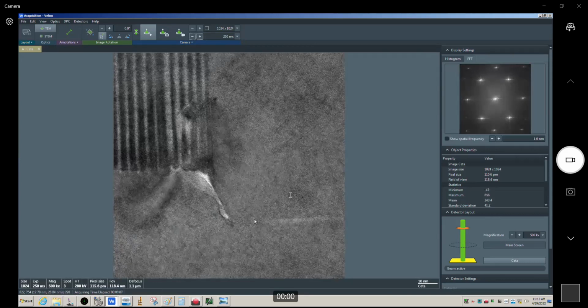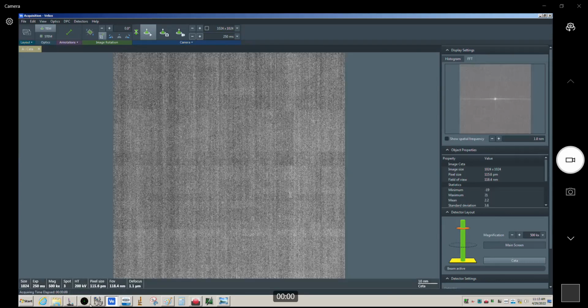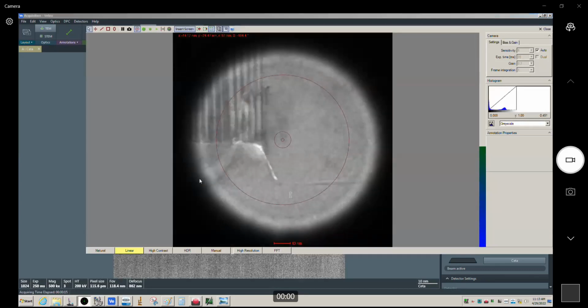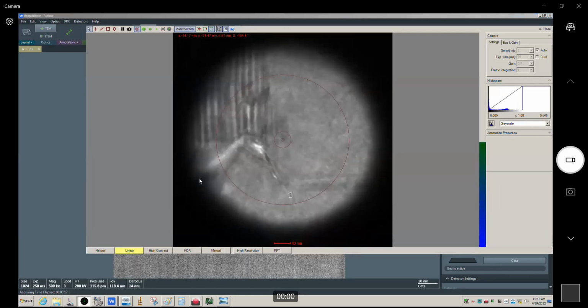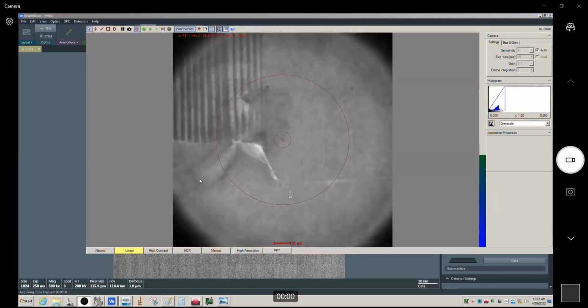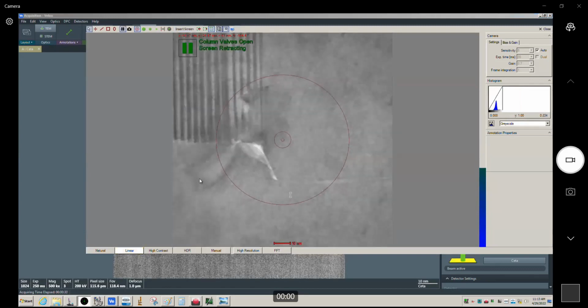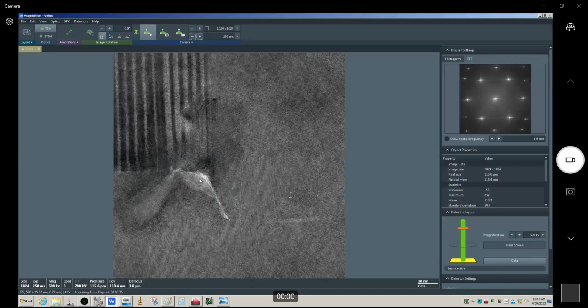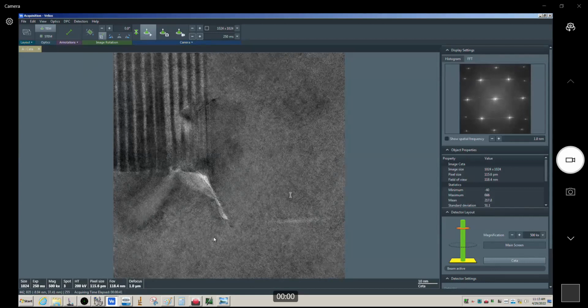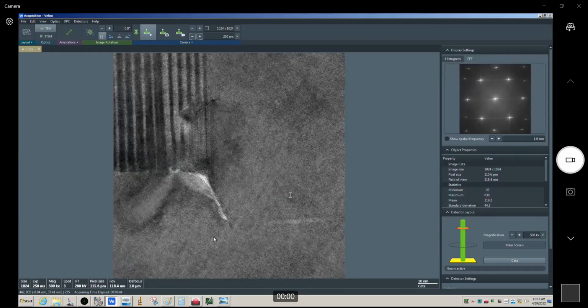So you'd have to use the flu screen, converge the whole beam down, and then minimize the image delocalization. You can actually see it here. Right about in here. And then from here, you can make small changes by looking at the image on the camera itself. If we go backwards here, you can see, but relying on the FFT here becomes not very practical. Same idea as with the astigmatism.